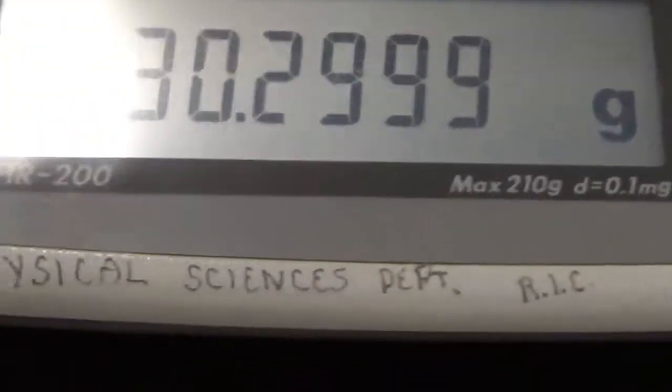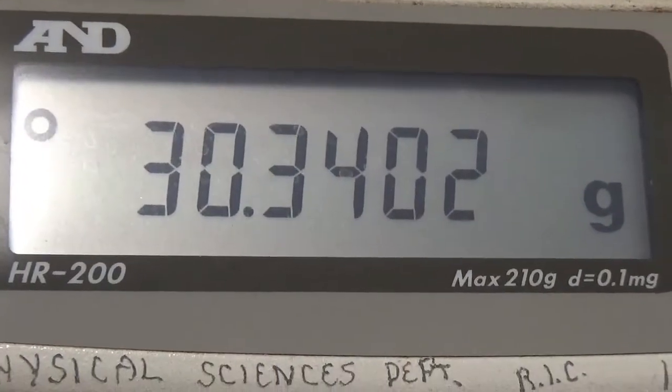I'm going to re-zero it. Mass of the beaker for the upper layer is 30.3402.